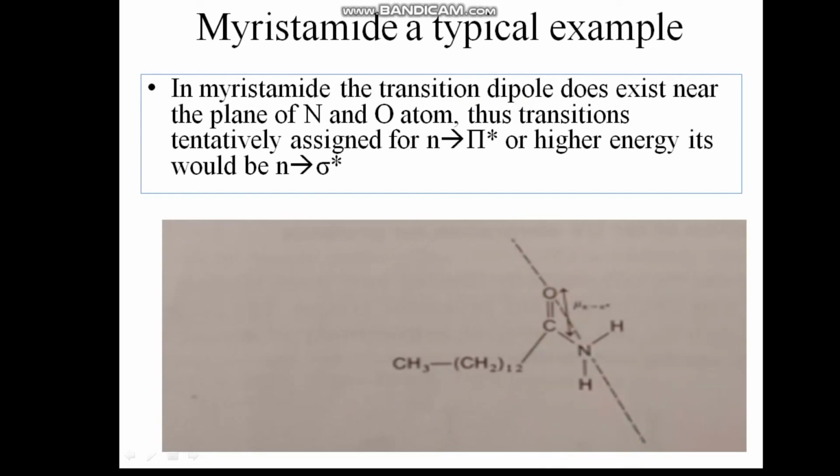But unfortunately, the electron delocalizes. Because the electron delocalizes, the pi to pi star transition does not happen. It is forbidden. What really happens is n to pi star. Maybe at higher concentration or at higher energy, this even changes to n to sigma star. So this is what really happens. This clearly tells that in the far UV region, the peptide dominates the spectrum.